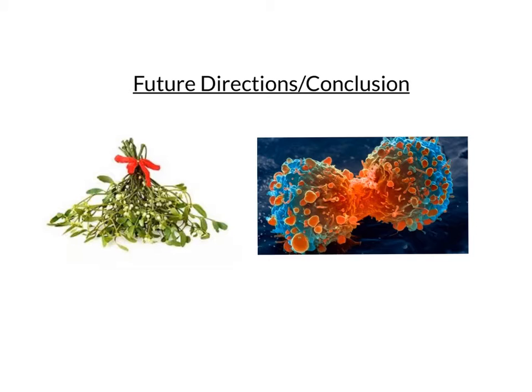Even in the 12-hour assay, it can be seen that there are cells that were currently undergoing apoptosis and fragmenting, and also cells that have completed their apoptosis cycle and have already fragmented, waiting for a macrophage to come and eat them up. The comet assay showed that there was some degradation of the DNA in the cells treated with the extract. It was too early to see extremes in the degradation of the DNA, but it can still show that there is some degradation.